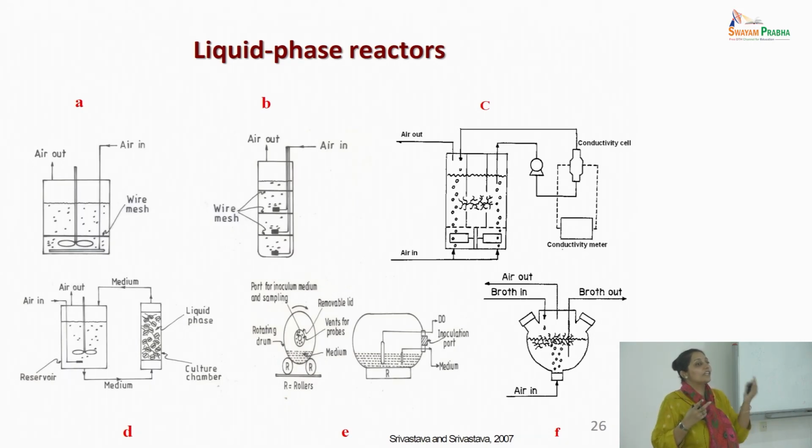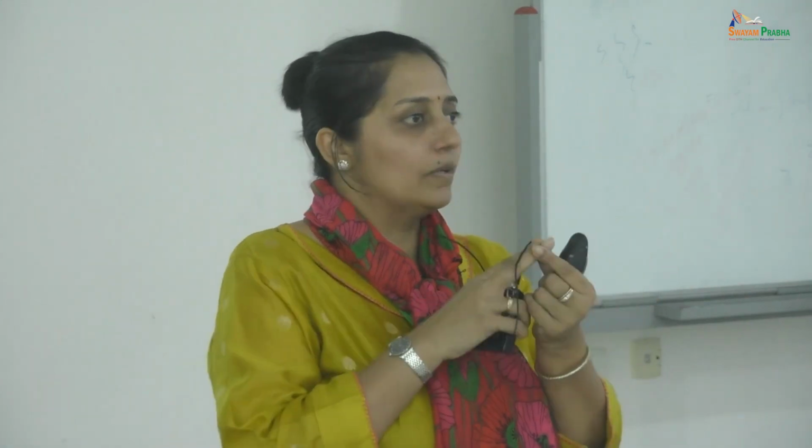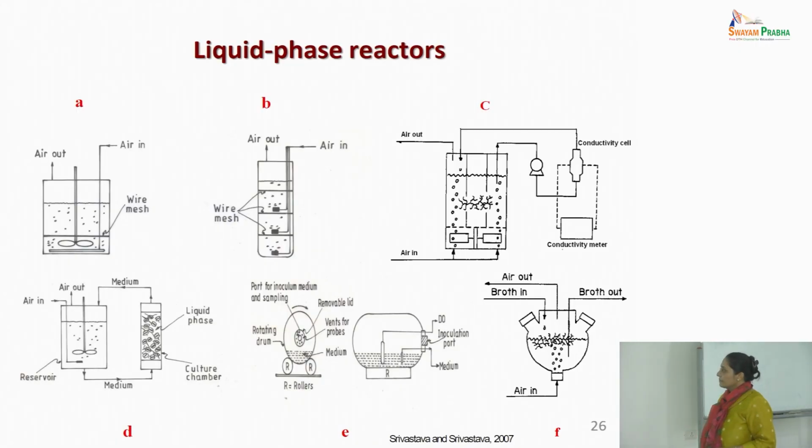The way out is that when you are initially inoculating, you divide the inoculum into much smaller parts. Let's say you are working with 10 grams per liter of inoculum, I'm giving you a scenario. Why don't you divide the inoculum in the same reactor into 5 parts, which means a support for 2 grams, another support for 2 grams. People have come up with designs where they have segmented the reactor, and you will come across various designs in literature to meet the culture requirements.